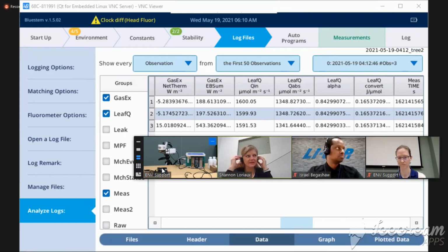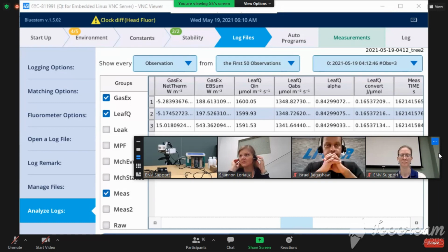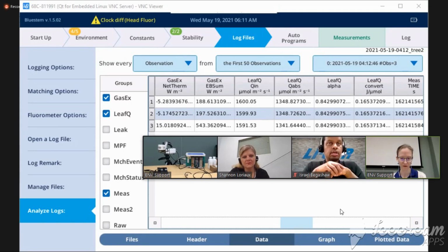I'm sorry, I missed that. It was sunny. The light was there. Okay, it was sunny, the light was there. Okay. Yeah, I guess.